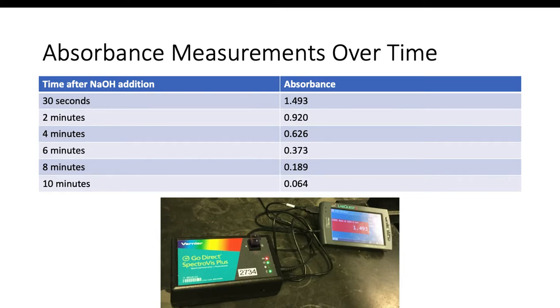The nice feature about that relationship is that everything we do this week, we can actually just use the absorbance to do all of our calculations. We don't have to worry about using concentration for anything because the relationships we're looking at and how things are changing are really more about ratio changes. And since absorbance will change by the same ratio concentration will, we can just use absorbance instead, and everything will come out exactly the same as far as our final kinetics-based results.